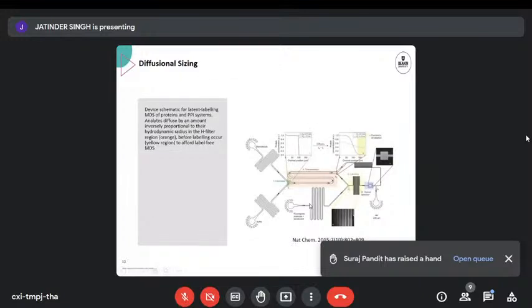So that's free diffusion. So we get two proteins interacting in free solution first. Then we get the addition of a fluorophore, it's mixing, and then we can look at how the fluorophore has bound one fraction or another and derive back how much they've interacted by which side of the channel they've diffused into. But I'll have to have another look at that paper because it's too long ago that I've read this one.